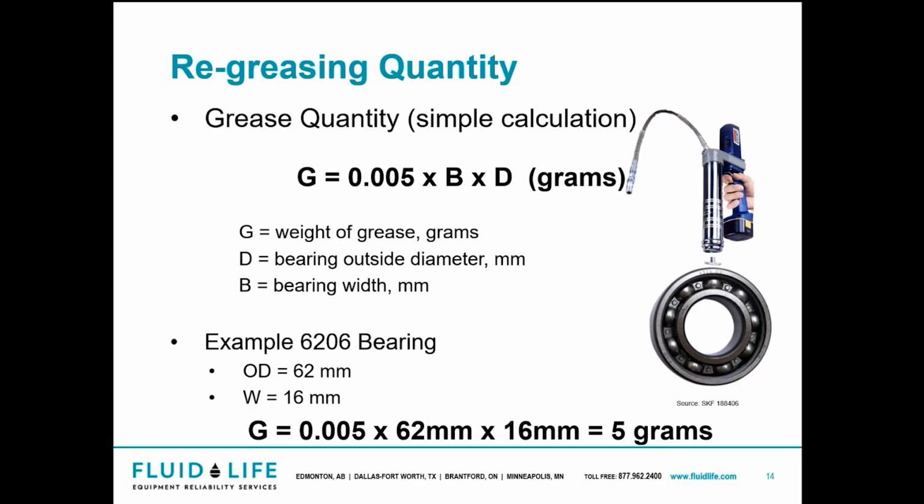I'll probably touch on calibration a little bit more again. But we take, for example, 10 pumps of grease, put it on a piece of paper, pump the 10 out, measure the mass, and divide it by 10. Just for the example, say it's 1 gram per pump, okay? And then the next thing is, how much grease do I need? So I'll do a calculation like this.